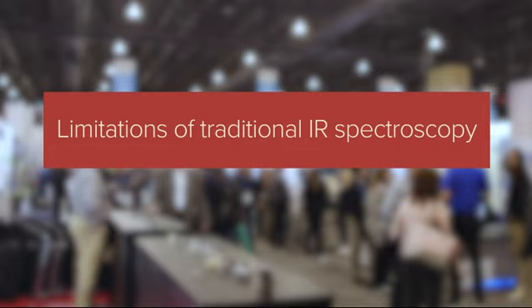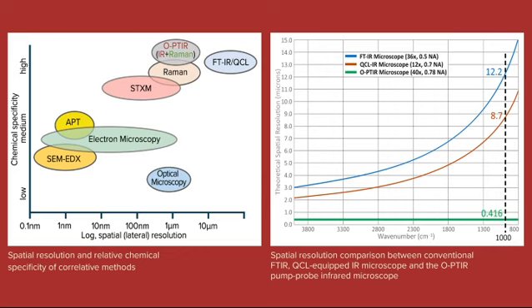Because of using these long wavelengths, the primary limitation here is spatial resolution. You can only measure things as small as, roughly speaking, the wavelengths of light you're dealing with. And in the mid-infrared, that's in the order of 10, 15, 20 microns in practice. So anyone doing microscopy, you're wanting to look at small things, but you're faced with this wavelength limitation, this diffraction limit. So we've overcome that by not actually measuring with the infrared. We're exciting with the infrared, but we're actually probing, detecting via this secondary beam, this probe beam, this green laser, typically green.